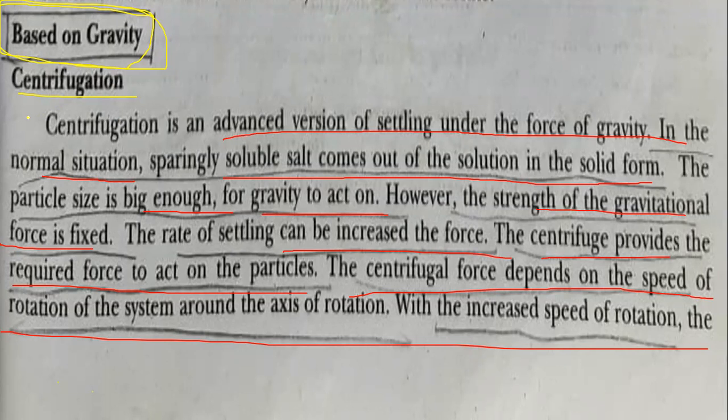What happens in the normal situation? If the particle size is large enough, then the solid or solute easily settles down at the bottom of the solution. But if the particle size is very small, it does not easily settle down. So to separate those solids, it is necessary to apply a force, and that force is a centrifugal force, and hence the technique is centrifugation.